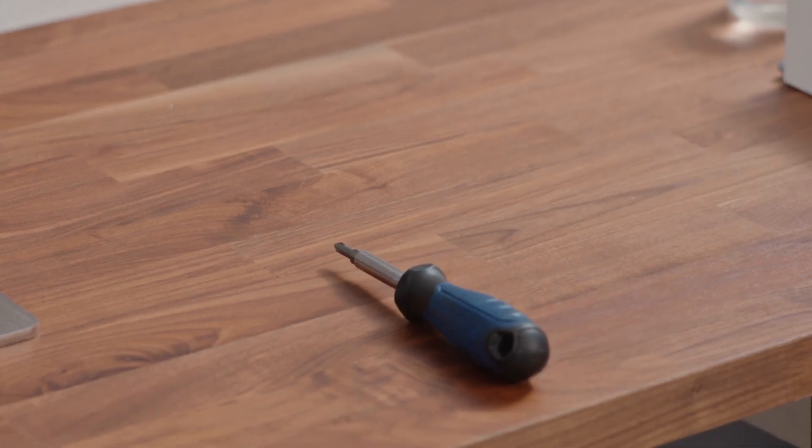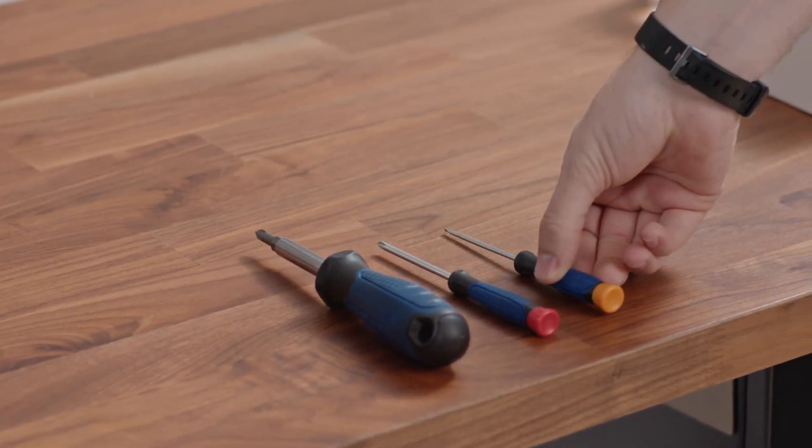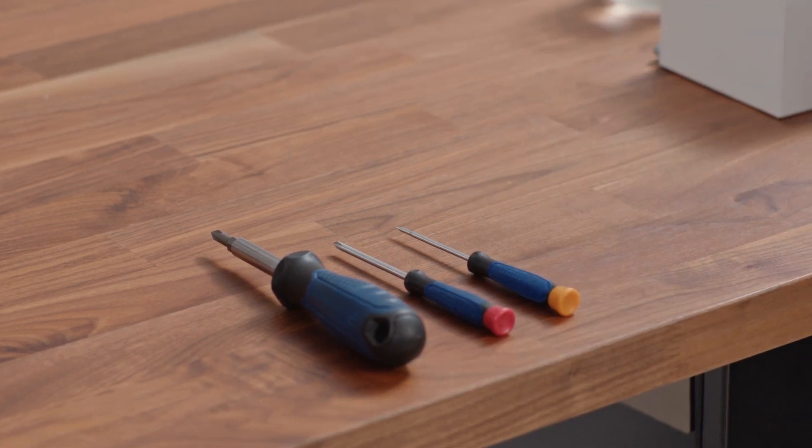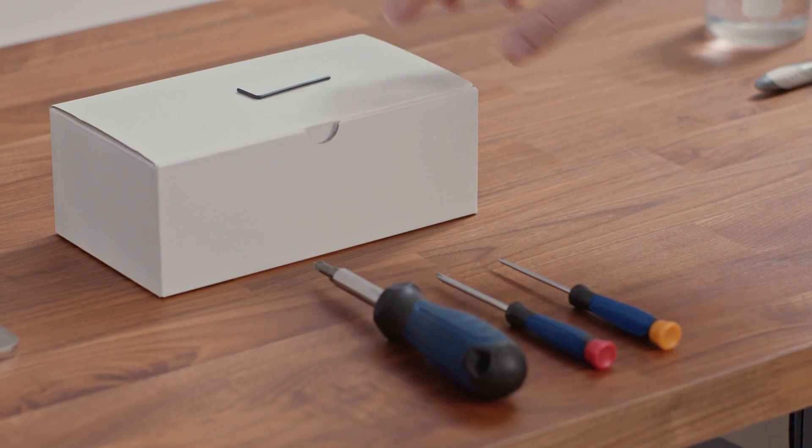You will need a large Phillips head screwdriver as well as a small Phillips head screwdriver, a flat head screwdriver, and the two millimeter allen key included with the FC-800 parts.